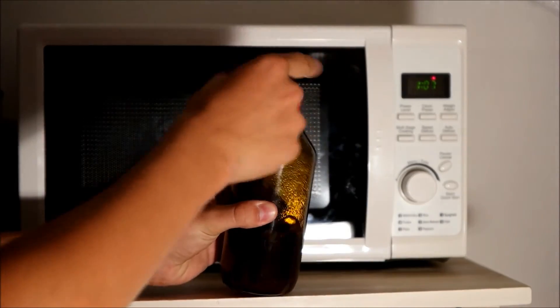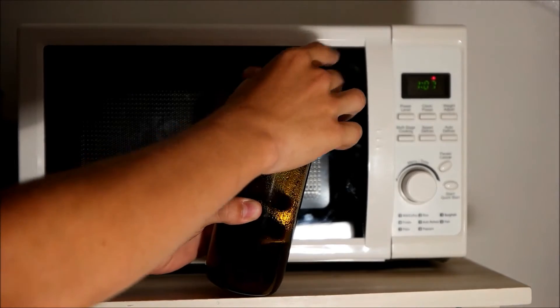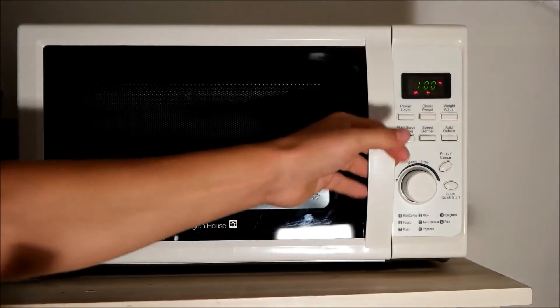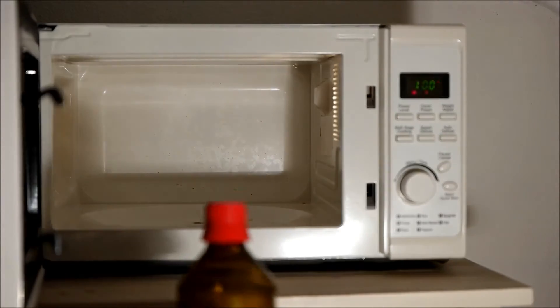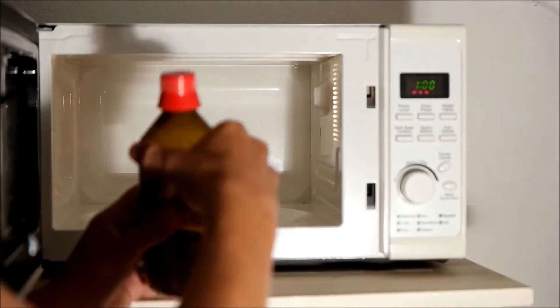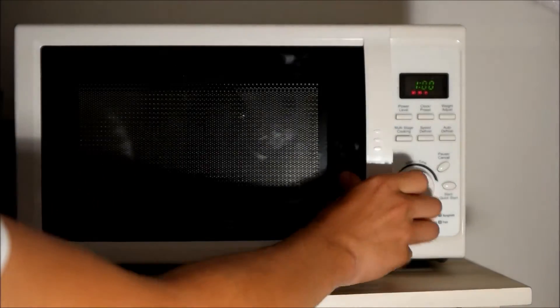— if you close it like this, it will explode. So just put the cap on loosely like this. Then set your microwave at high power for one minute, put the medium inside and start.